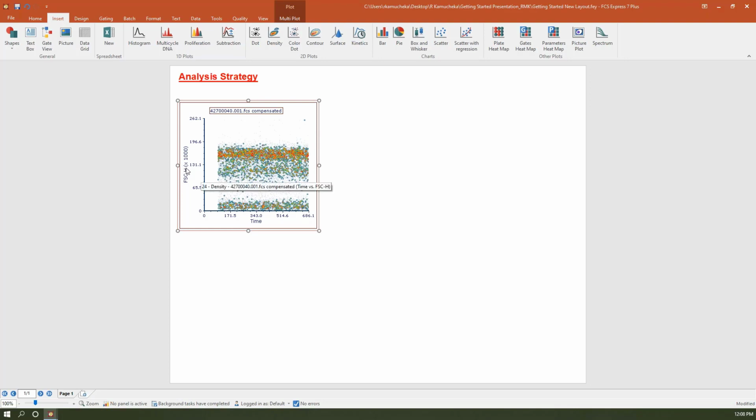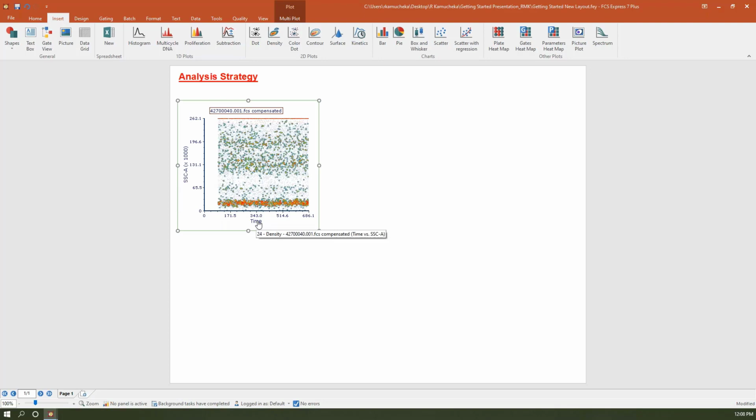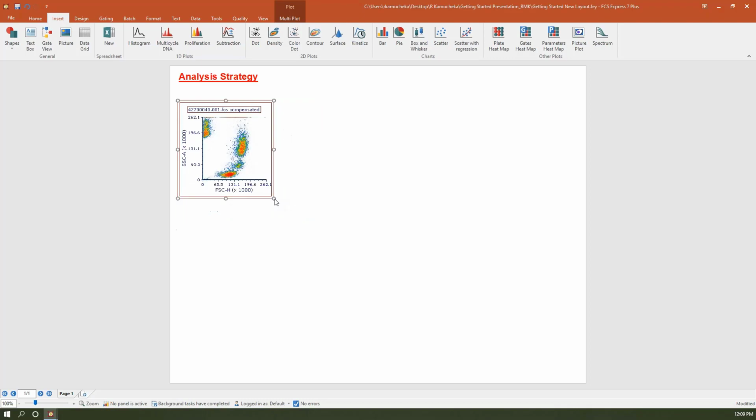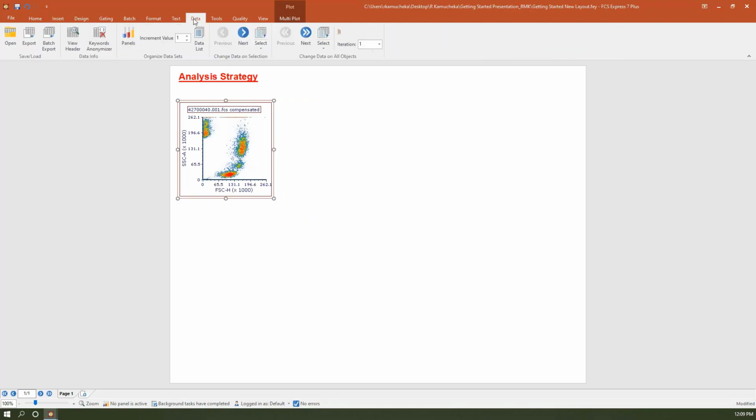Now what I'm going to do next is I'm going to adjust these axes. So these are just our default axes. If you need to make adjustments, you can reach in through the drop-down menu and just grab one. Also, if you have 40 plus parameters, you don't have to dig through them all. You can start typing and it will parse down that list, and then you'll be able to select it quite easily.